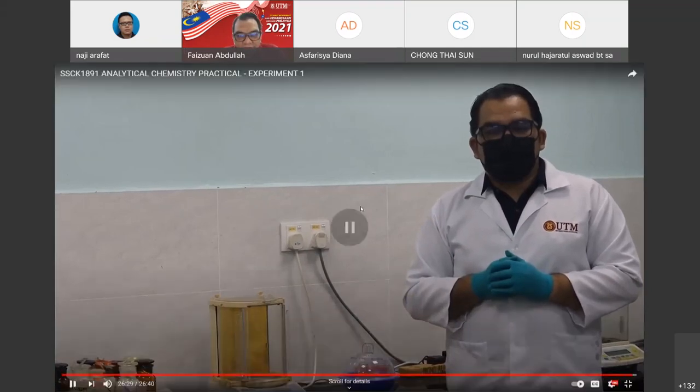Can you pause the video for a while? Okay, guys, if you heard what Dr. Najee explained in the video, we need to dry and weigh again several times. We need to let the crucible cool in the desiccator. Okay, it is a simple question. It is also related to the process that we need to put in the desiccator previously. So why do we need to let the crucible cool inside the desiccator? Why can't we just weigh it while it is hot?